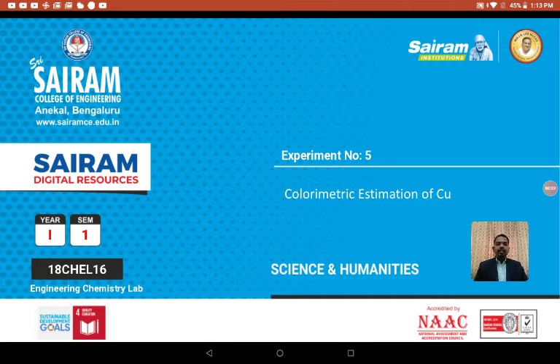Today we are going to discuss colorimetric estimation of copper. So we have seen how to estimate FAS using potentiometry, how to determine the endpoints of different acid mixtures by determining the conductance, and how to determine viscosity. Today we are going to find out the amount of a substance present in the given sample by measuring the absorbance.